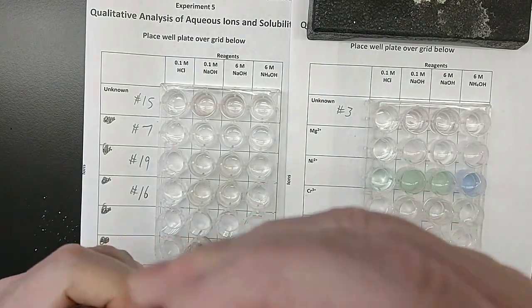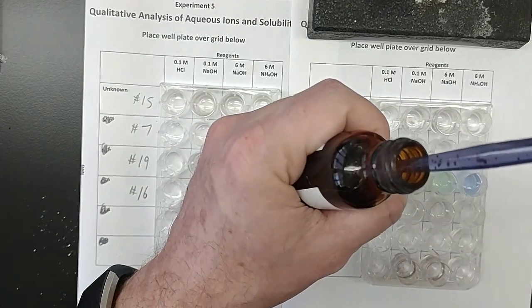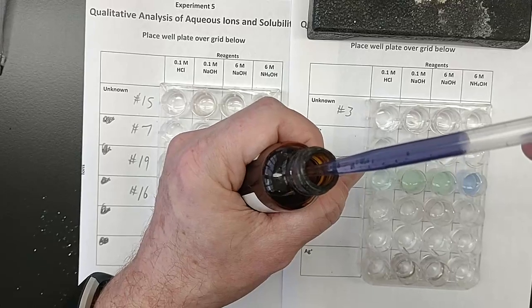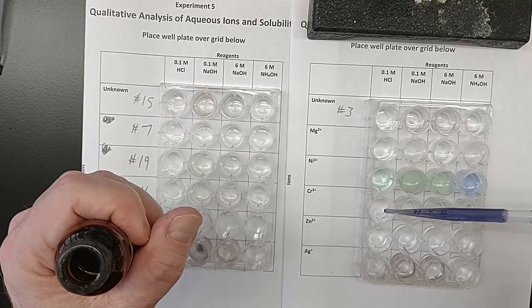The dropper doesn't work. Use a clean other one. This is see-through but purple. Transparent purple to start with. Transparent purple. Write that down. Into the chromium row with the hydrochloric acid.